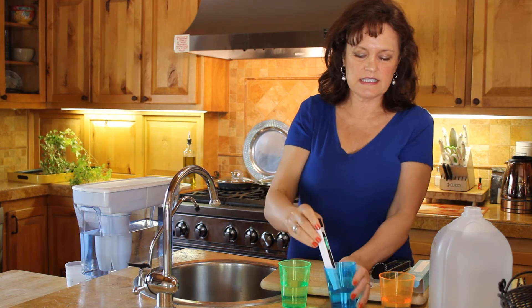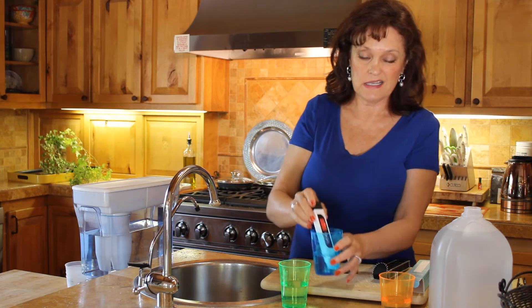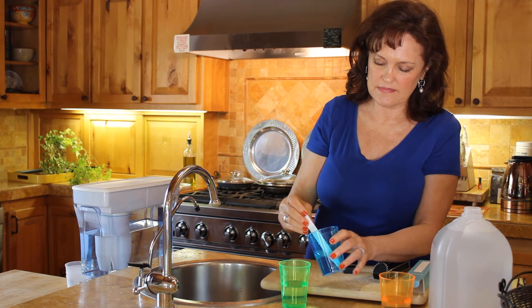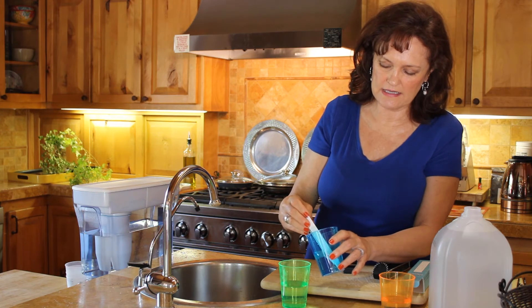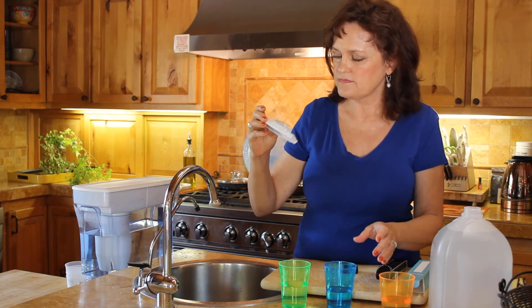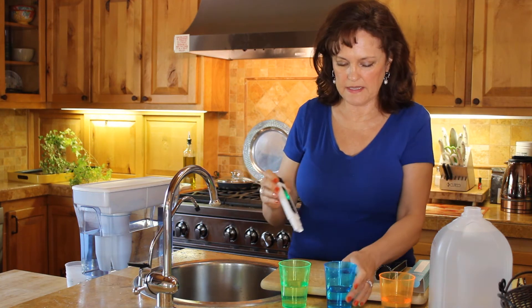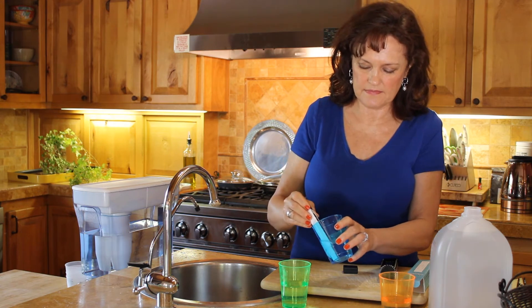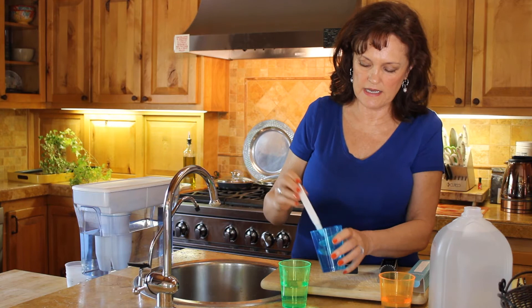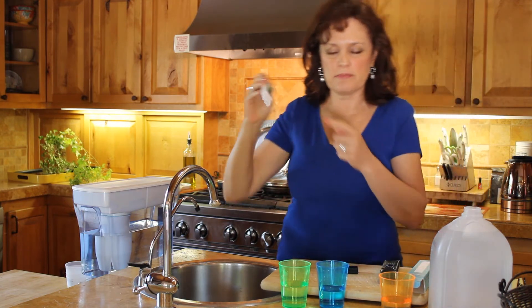I'm going to stick it into the cup that has the regular tap water. It's coming out red already, reading around 395 parts per million.